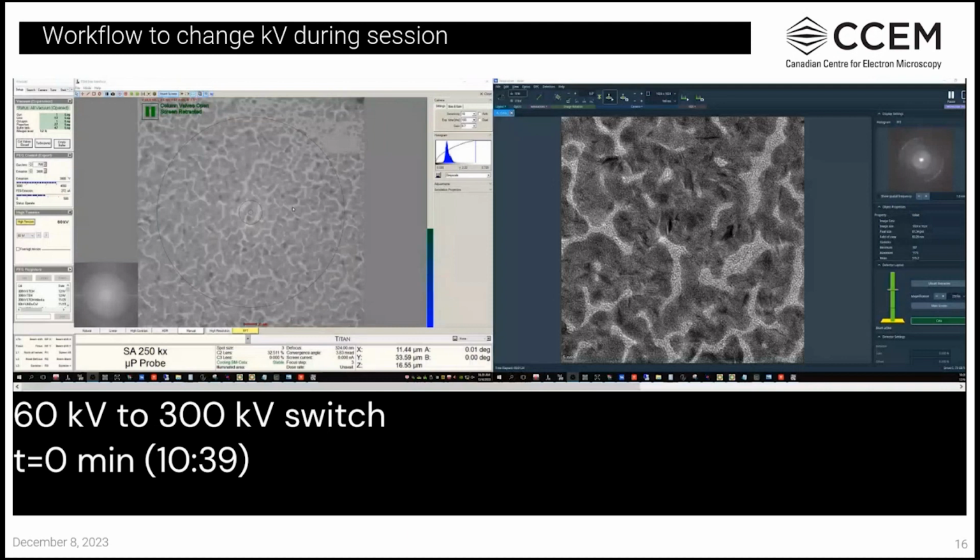Okay, so now that's done. And then now let's say I can go to find my ROI, zoom in. I'm just going to choose this area right here. And then I can bring in my OptiSTEM. I'm sure at some point. Is it going? Okay, yeah.